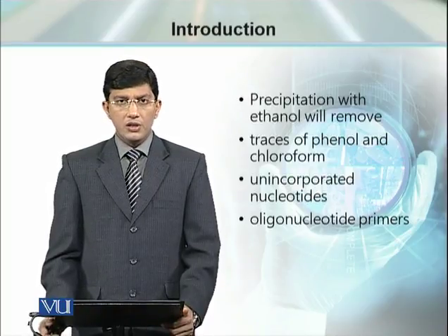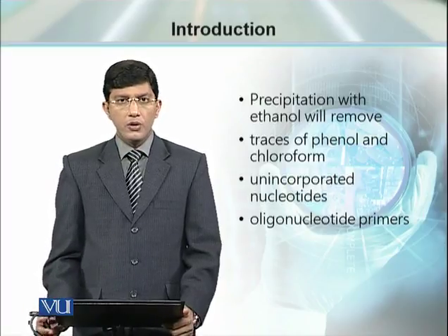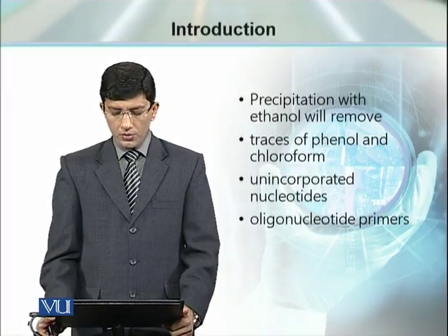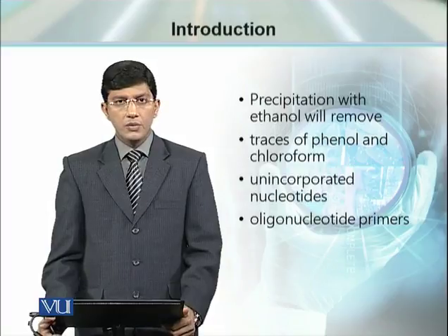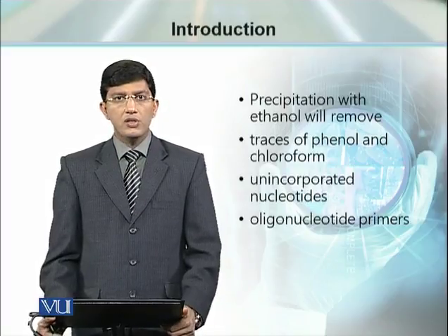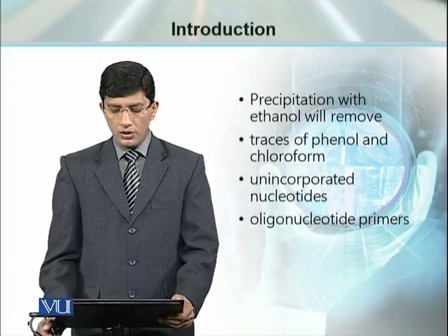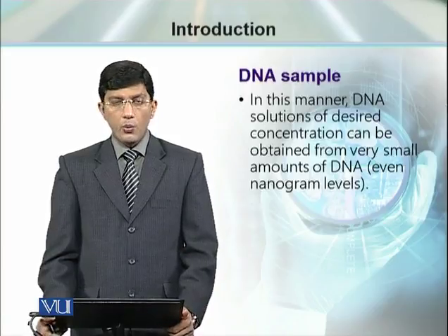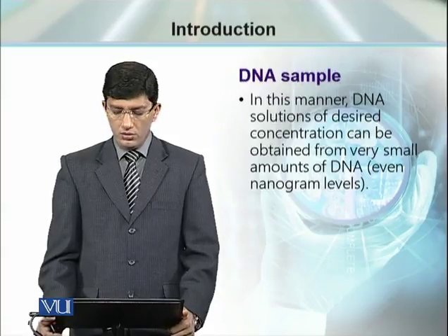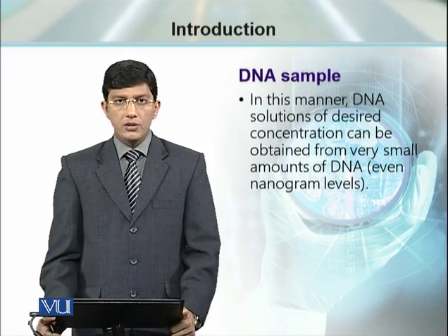By ethanol precipitation, another benefit is to remove the traces of phenol, chloroform, or any unincorporated nucleotides or oligonucleotide primers, or anything which is unwanted during further use of DNA. Once DNA is purified using the ethanol precipitation method, we can use it for further processing.